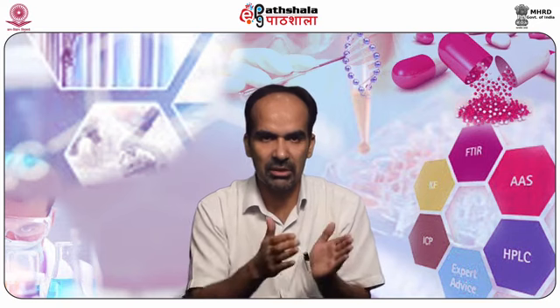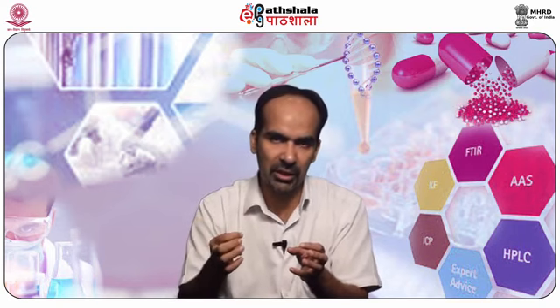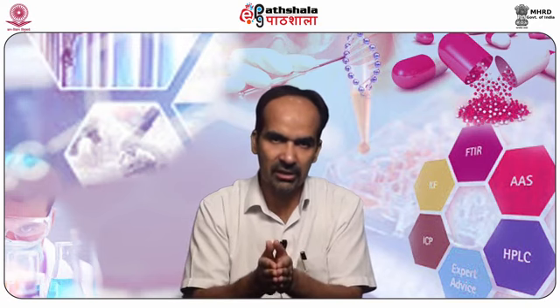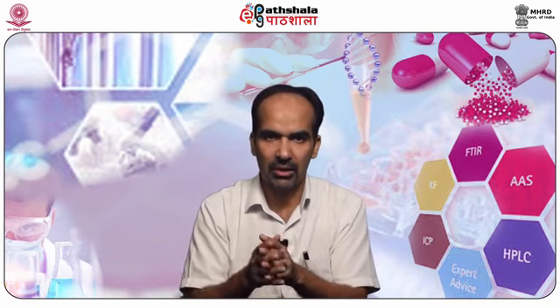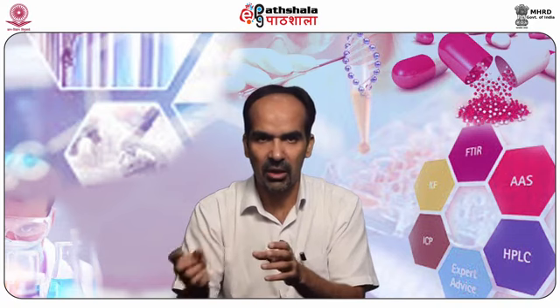It can be a simple steam distillation where the plant material is put along with water in a distillation flask which is fitted with a condenser, and the contents are heated. The steam along with the oil distills off and is collected in the receiver. The volatile oil and water separate into two immiscible liquids, and the oil can be removed.